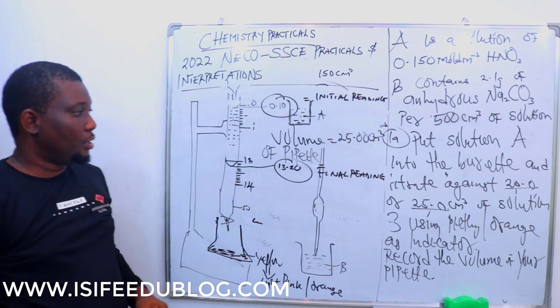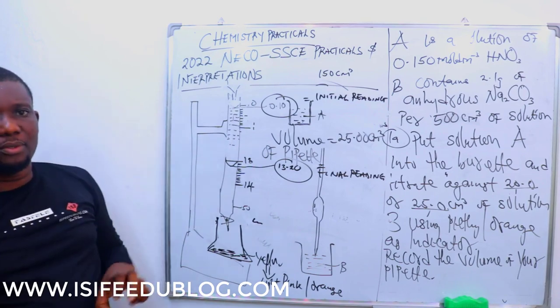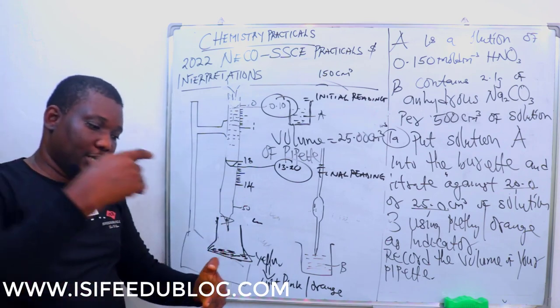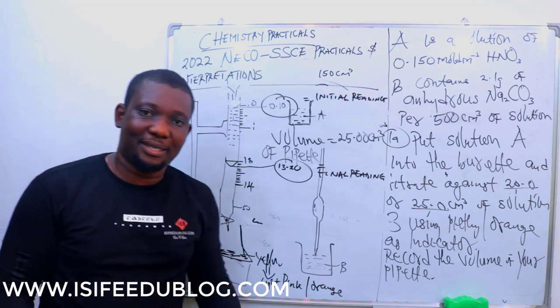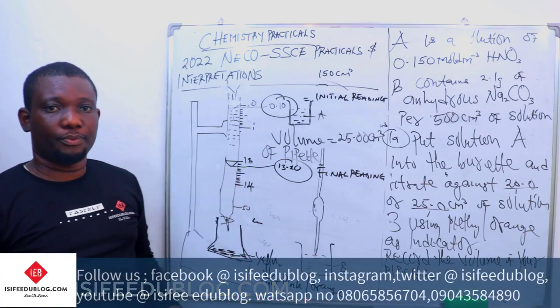Okay, so I'm going to draw a table now. This is going to be the rough titration. You do the same thing again and again, and when you are doing it again and again, you are doing it to ensure a consistent titer. So let this first one be your rough titration.